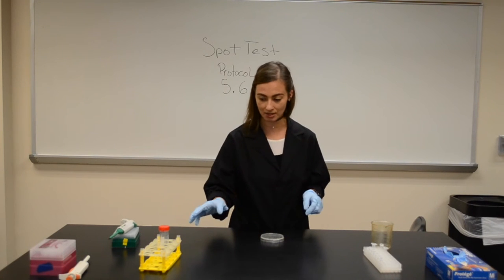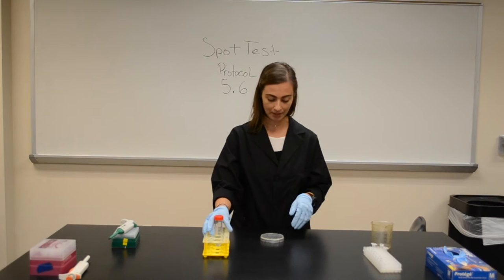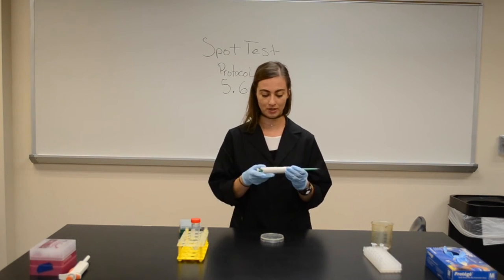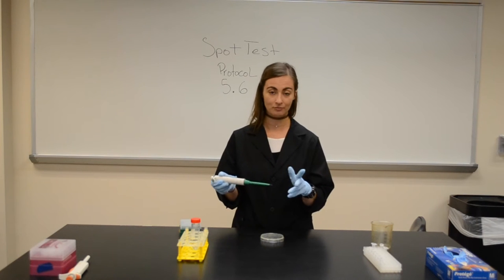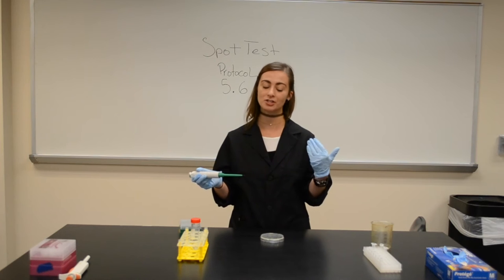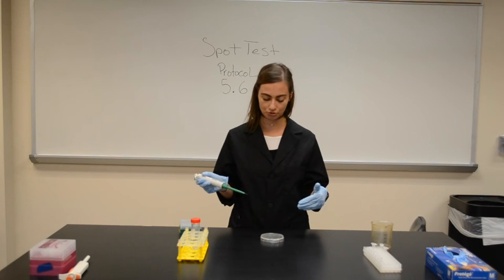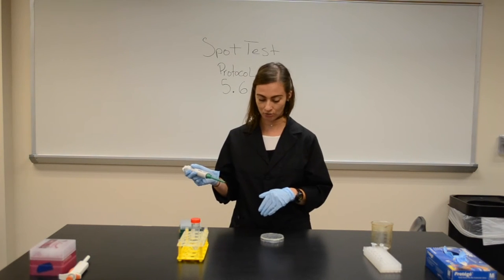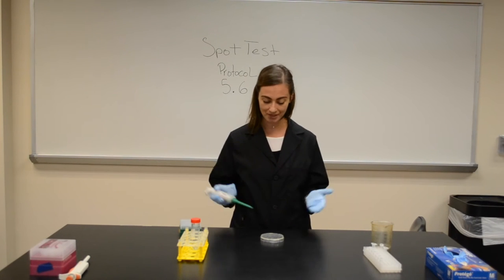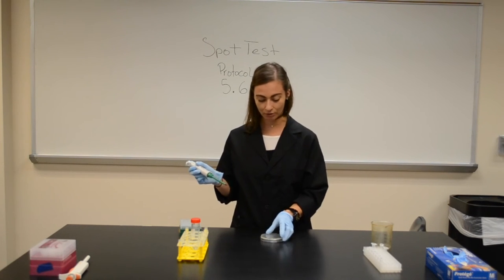What we're going to do is take our filtrate and use a micropipetter that is already clean. Remember, since we're in the lab: your table has been cleaned, you're wearing gloves, your hair is pulled back, you have your lab coat on, closed-toe shoes, and you are keeping your mouth closed in the zone of silence. Your plate is labeled.